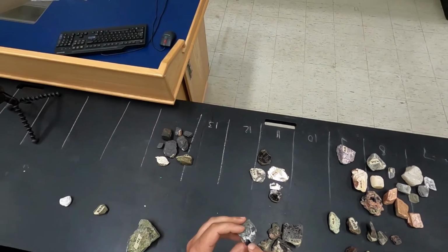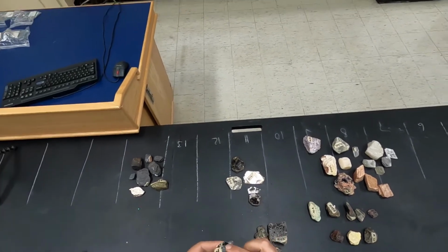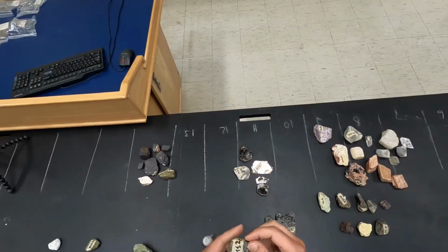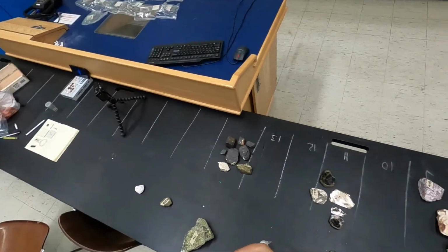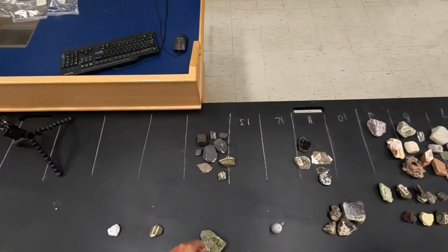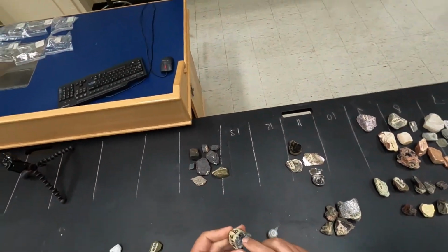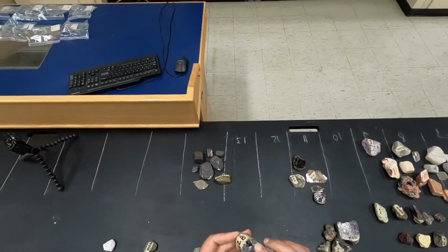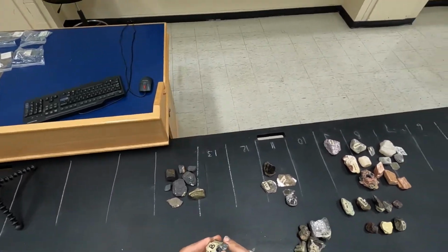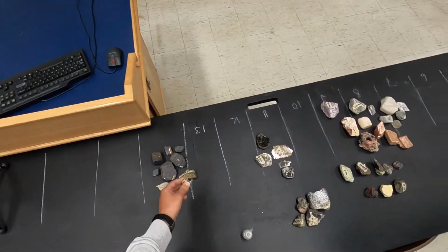This is quite dark, and it's actually a spinel. Spinel will be a relatively hard mineral, and quite often could be closer to these opaque minerals, although it depends really on the composition of the spinel. Some spinels will be very translucent, but this example here is not really translucent, so I would place it in here.